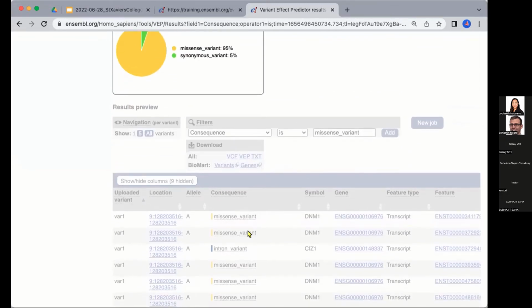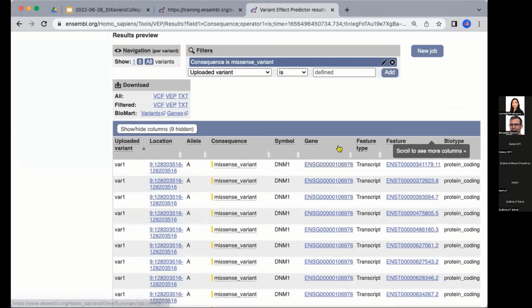It's just taking a little time to load. If your internet was ever a bit slow, you can use one of the Ensembl mirrors. So I'll just show you how to go to them after I finish this demonstration.